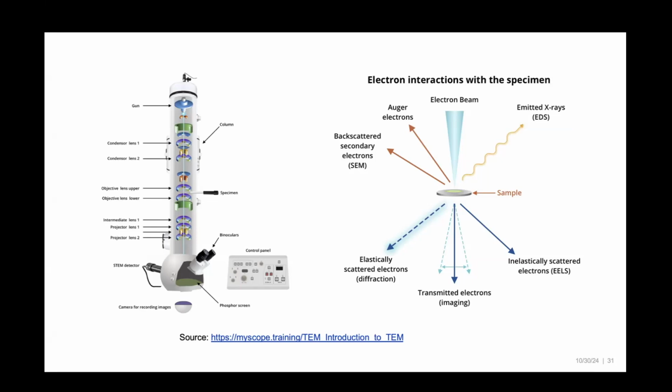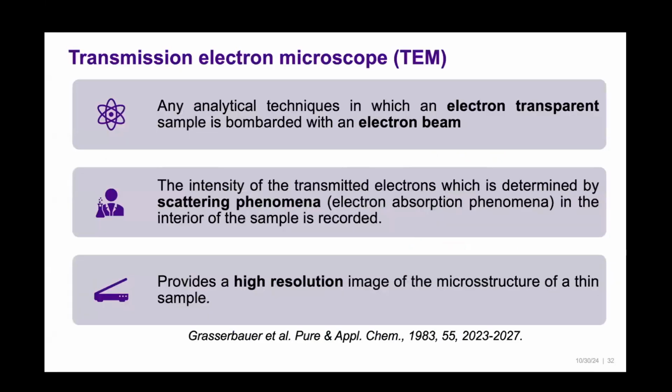So in transmission electron microscopy, we are not just looking at material morphology or structure. We can look at the X-rays, like elemental mapping. We can look at the surface topography. We can look at how the structures are by diffraction pattern, just like X-rays. Or you can do spectroscopy. That means almost everything that can be done with multiple instruments can be done in a single instrument, and you need an extremely small amount of sample. So that is the beauty of this. It's not just imaging. We are moving from imaging to real structural characterization. What happened in this process when you look at this simulator?